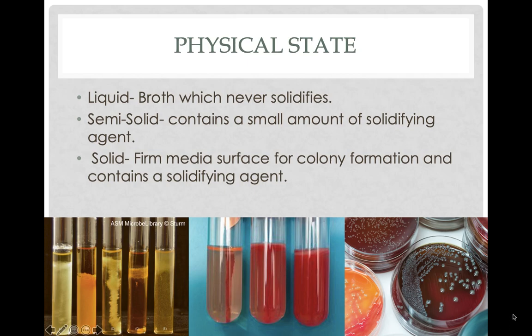And then the most common type of agar used in labs is petri dishes, solid agars, which are more like Jello with lots of gelatin in them. They're solid. You can physically touch these and shake them around. They're going to stay where you put them. They're not going to fall out of the plates and flop around. So this allows you to put bacteria on the surface, and it's going to be a fairly stable surface for bacteria to grow on. That allows you to work with them instead of having to risk spilling them over here with our liquids or them sloshing around with the semi-solid. So each one of these has different purposes.